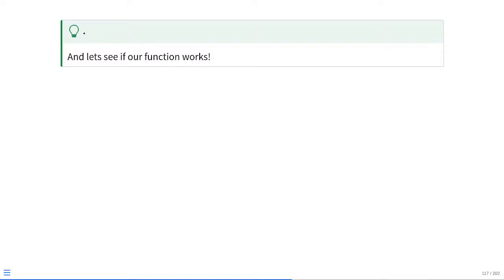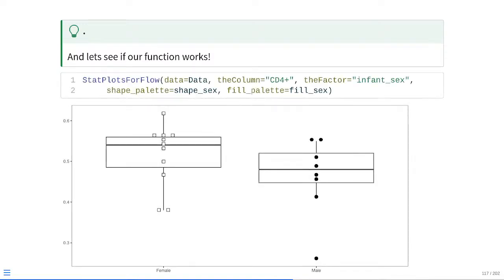And now let's go ahead and see if our plotting function is still working. So we provide the values in terms of the measurement column of interest and the grouping column of interest. And I'm providing these little vectors containing how they're supposed to shape these little individual dots. And it appears to be in working order based off of what we had, remembering back to week 6. Obviously, there's a ggplot too. We could customize the size. We could arrange how spread out the data is. We have a little bit of customization options as far as the final plot.